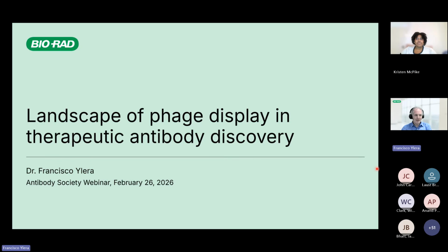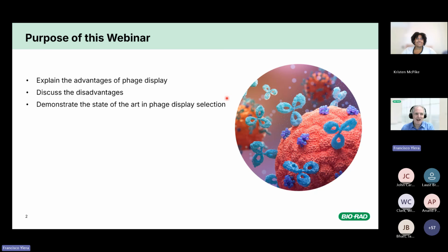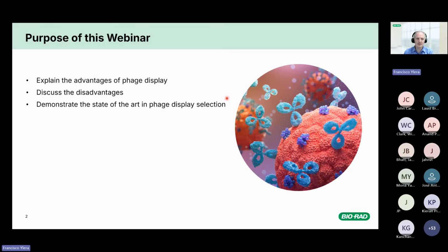Thank you, Kristen. Yes, so welcome to my webinar on phage display. In this webinar, I want to explain briefly what is phage display. Probably most of you are familiar with the basics. Then go into the advantages of phage display, the challenges, and then demonstrate what is possible if you use a modern technology and a modern library to generate what kind of antibodies you can generate.